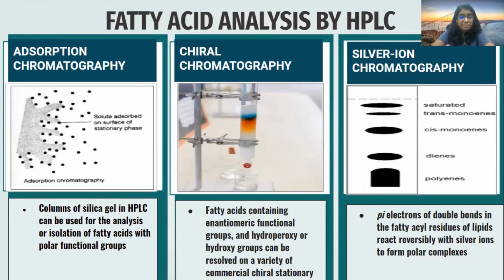Fatty acids that contain enantiomeric functional groups and also hydroperoxy or hydroxy groups can be resolved on a variety of commercial chiral stationary phases. Chiral separation is usually possible by gas chromatography, but it appears to be less effective in general.